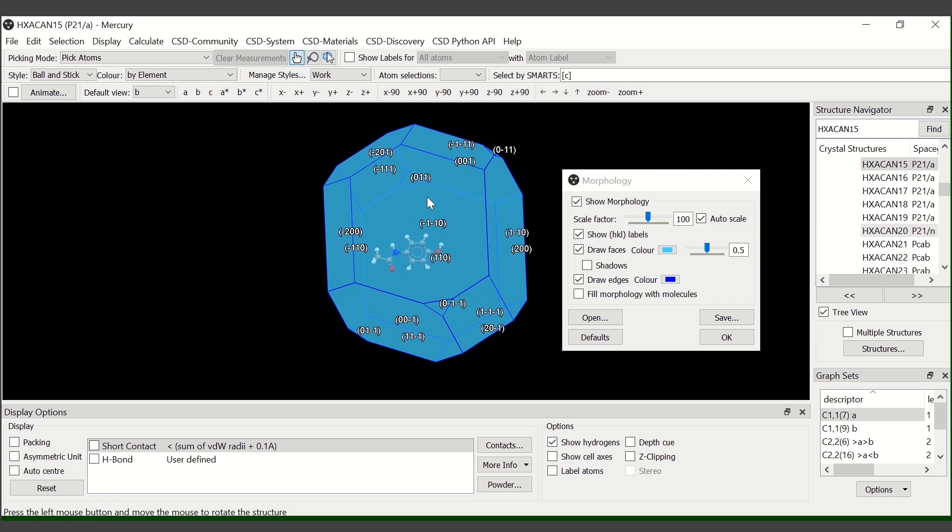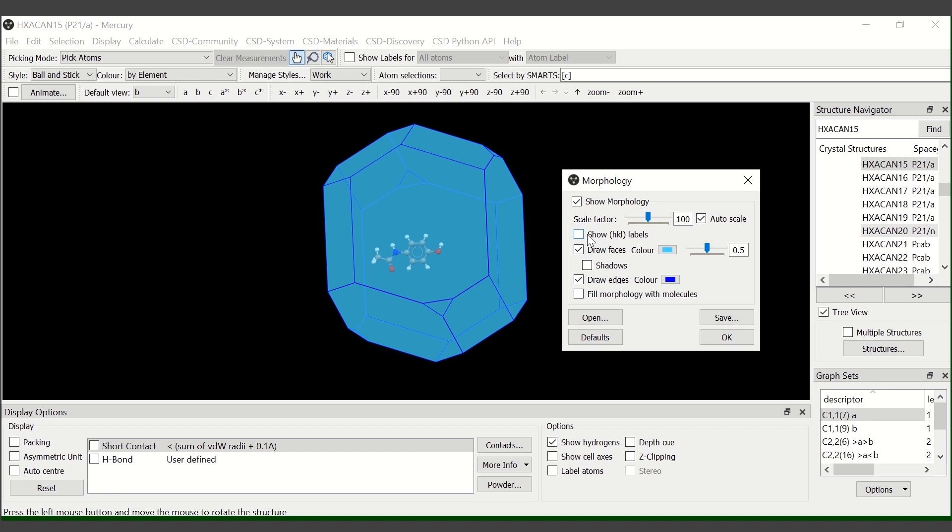If you want to remove the labels for the HKL planes, just untick the SHOW HKL labels. If you want to visualize, just tick it again.